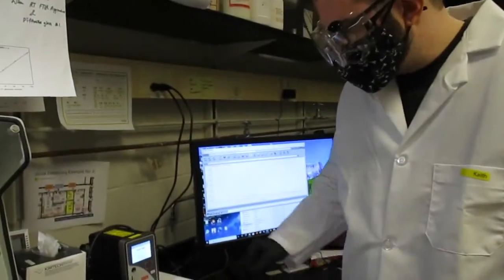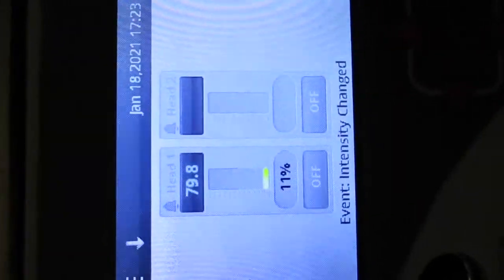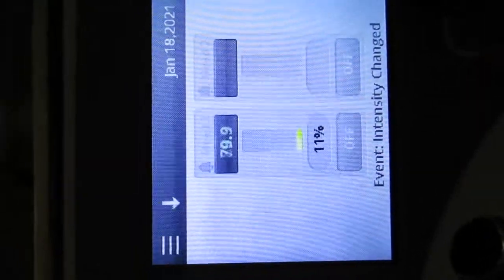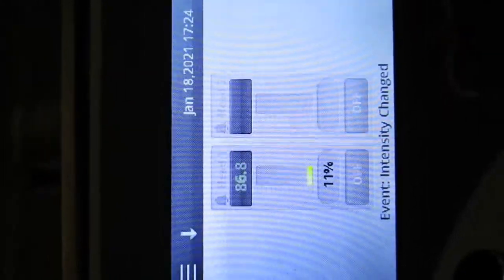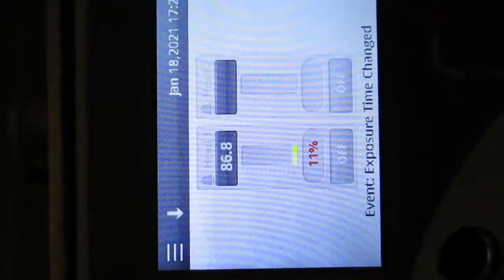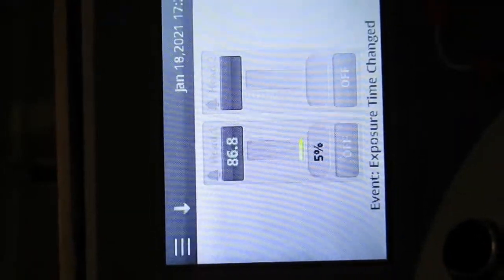Okay. So this controls the LED light. Once you turn it on, you'll be given these 2 numbers. The number up top is the amount of time you want the experiment to go. So to change the time, you have to hit select, and then you can use these arrows to change it. Make sure it's above your experiment time and hit select. And then you can also change the power or intensity using select and the arrow keys. Make sure you hit select at the end to set it.